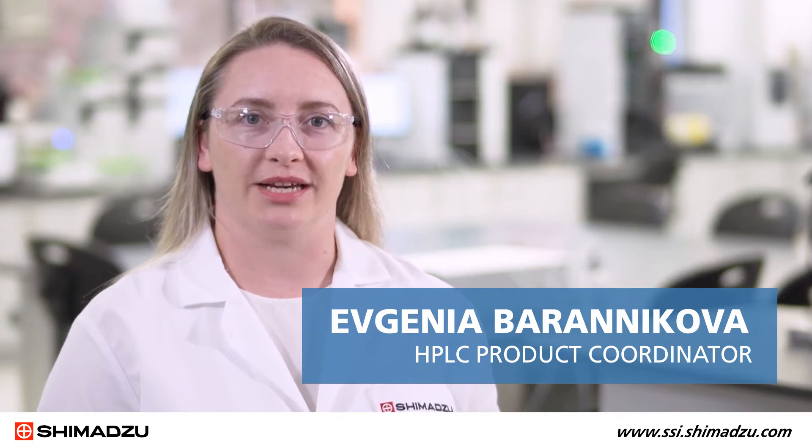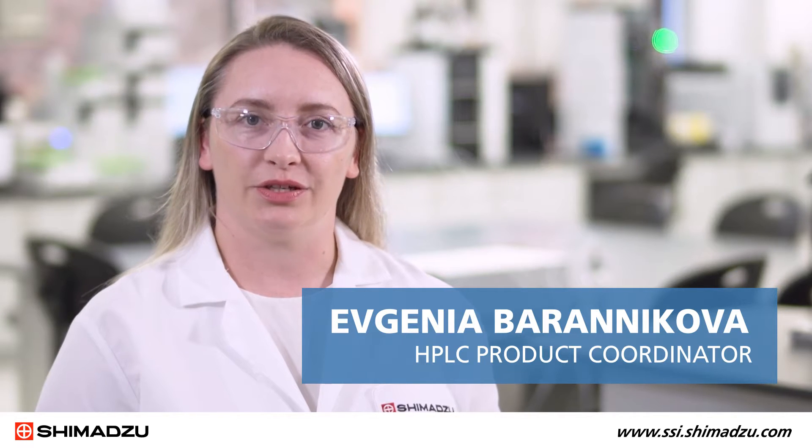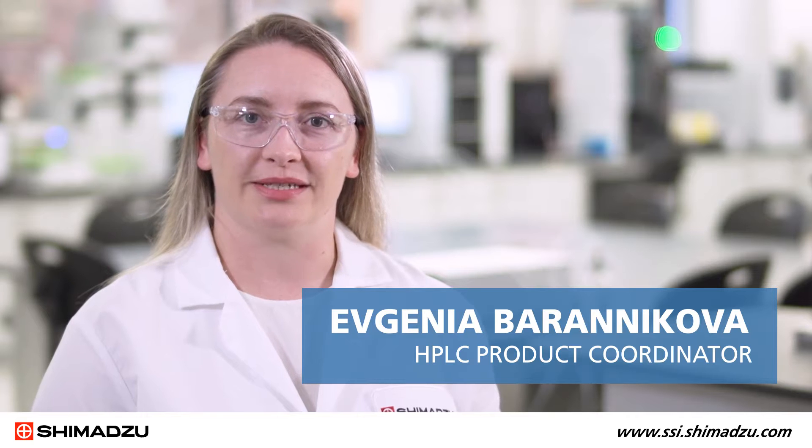Hello, my name is Evgenia Baranikova. I am NHPLC Product Coordinator at Shimadzu Scientific Instruments. In this video, I'm going to demonstrate the replacement procedure for the plunger assembly on a 40 series Nexair pump.